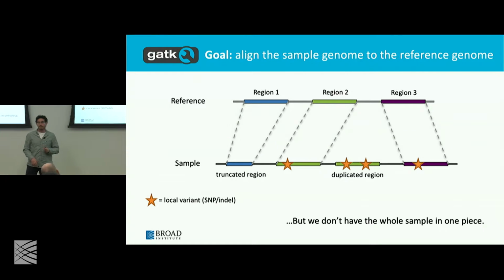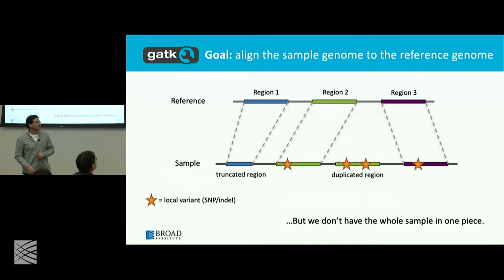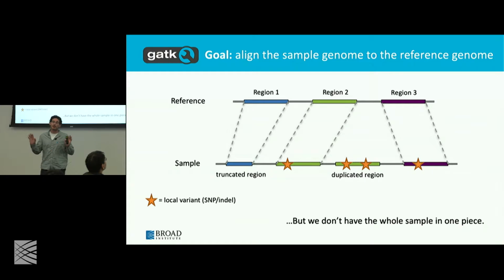But if you did get a read spanning the two regions, the aligner still can't say it's an additional copy. The aligner will not say. The aligner's job is to tell you where in the reference this read goes. That's it. It is unable to say, oh, this looks like an extra copy. What it will say when it looks at a read that spans over here is, this is very confusing. It looks like it comes from here, but then it doesn't match over there. And so it clips off the end, or it does all kinds of strange things.